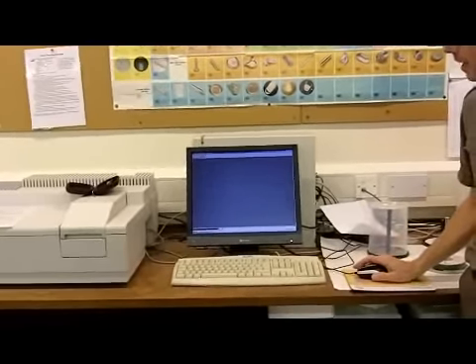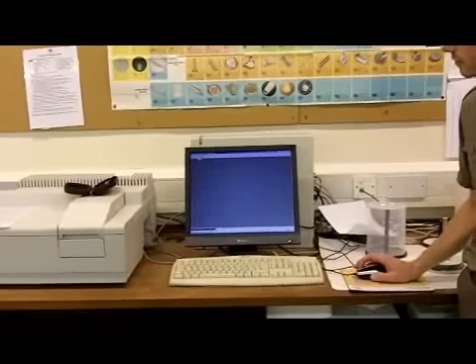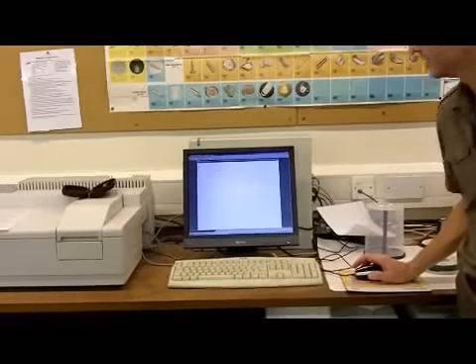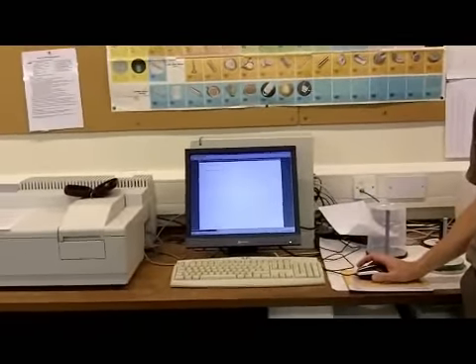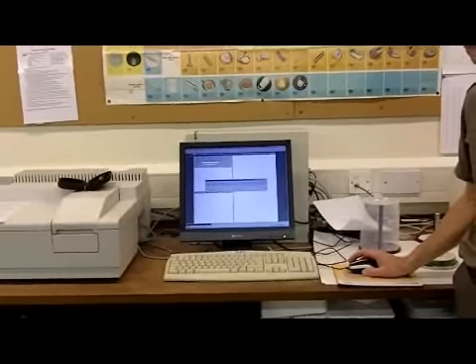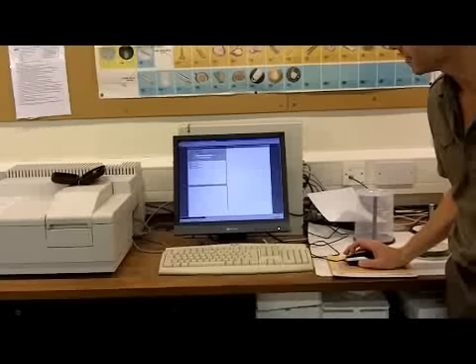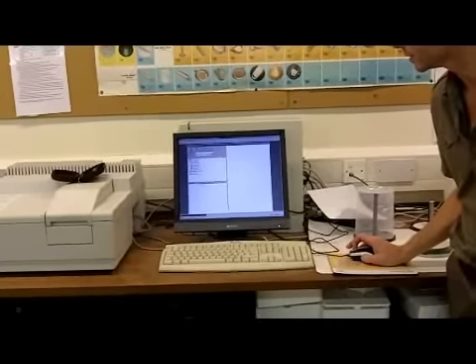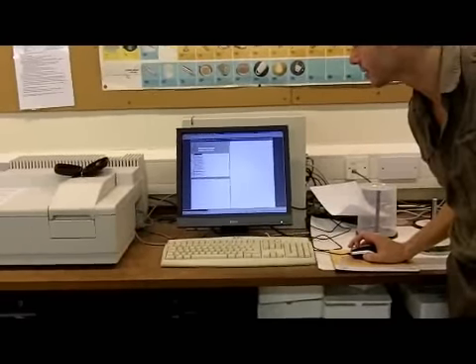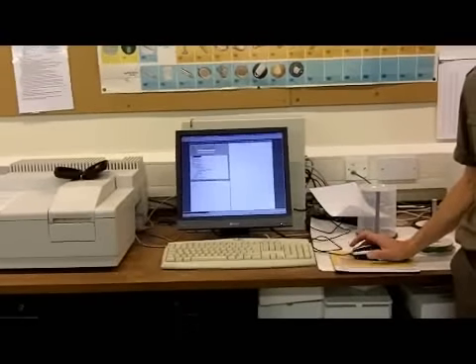So we go to the buttons up here, there's an open file button. We won't worry about that. Okay, so we have to navigate to where the data is, and it's on the CD under STM-XPS, STM data, and you'll see there are two experiments.